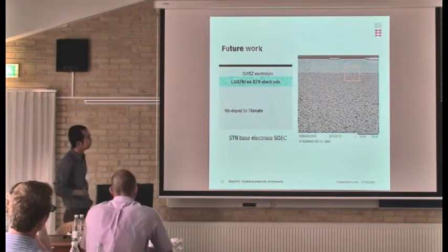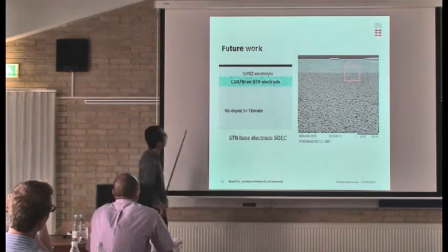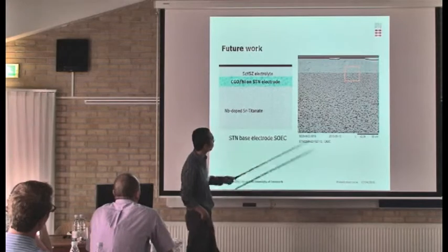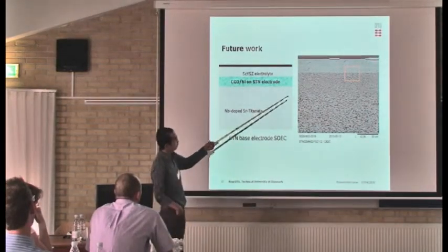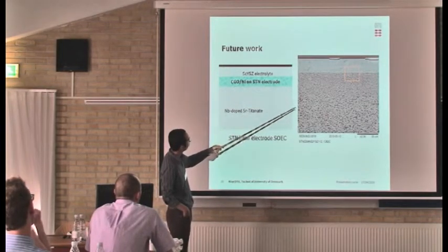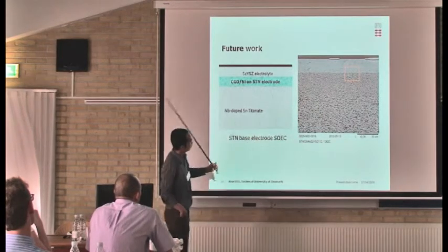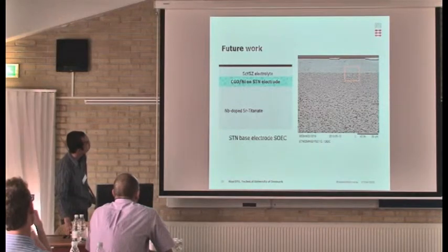And yes, this is my future work. I plan to do EBSD at the interface between the electrolyte layer and strontium titanate active layer of SOEC cell.